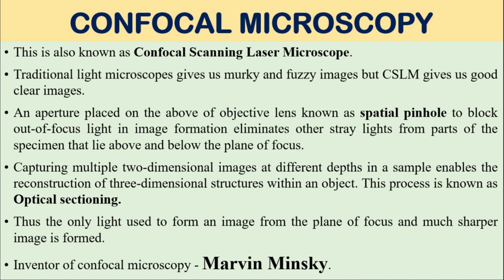Spatial pinholes are present in confocal microscopy. Capturing multiple two-dimensional images at different depths in a sample enables the reconstruction of three-dimensional structures within an object. This process is known as optical sectioning.